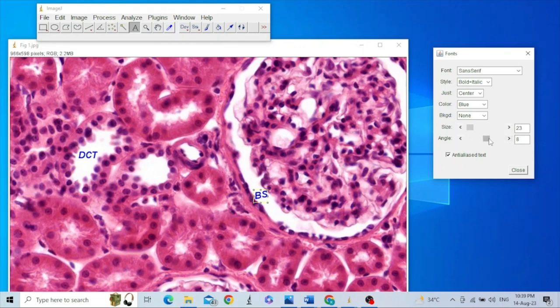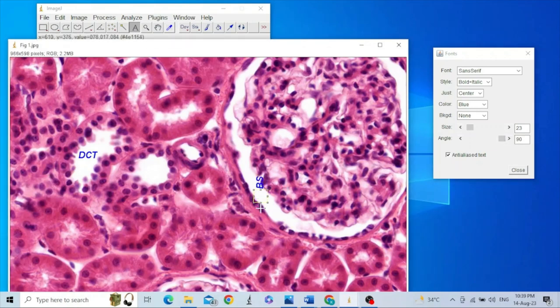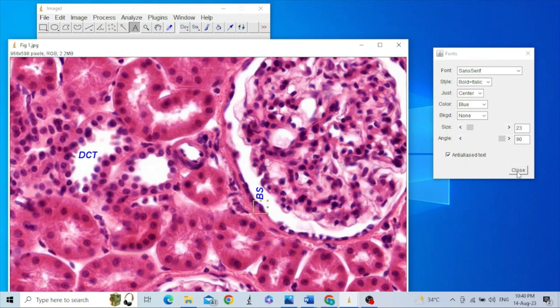For example, you might tilt it to a 90-degree angle and reposition it in the middle of the space. Then click Close.